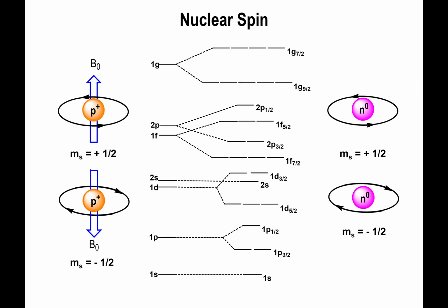Now, one thing that gets overlooked oftentimes in organic chemistry, but I think it's important to at least show it, is the fact that much like electrons yield different orbital levels that they populate as you're coming up with electron configurations, the nuclear state also has its own set of quantum levels, and I'm showing it right here.